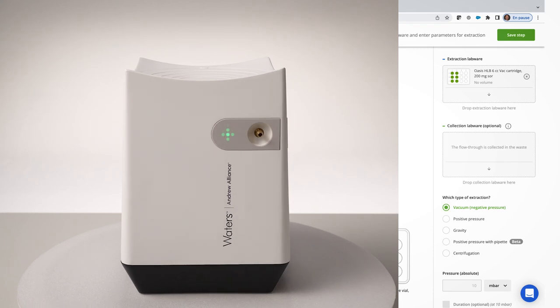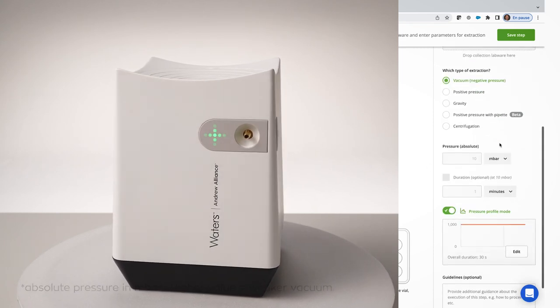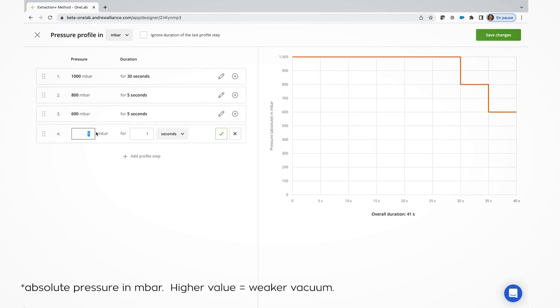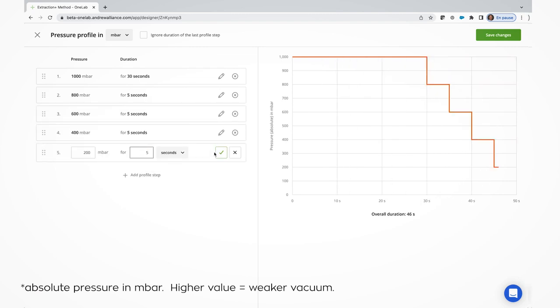With Extraction Plus and its connected pump, setting pressure profiles with properly timed and fully automated boosts is our answer to the trickiest matrices out there.